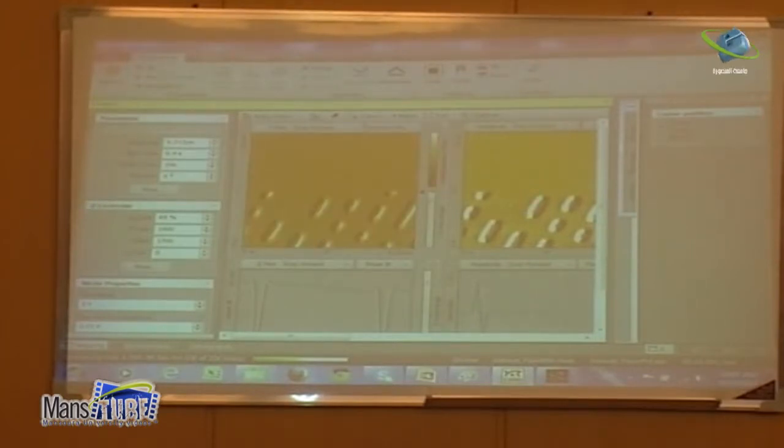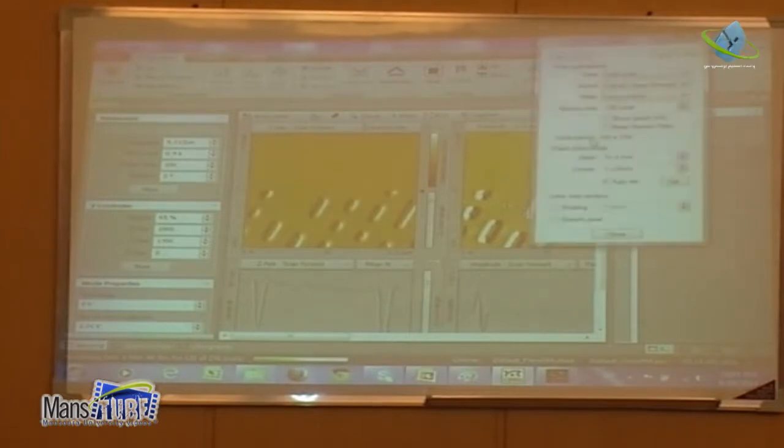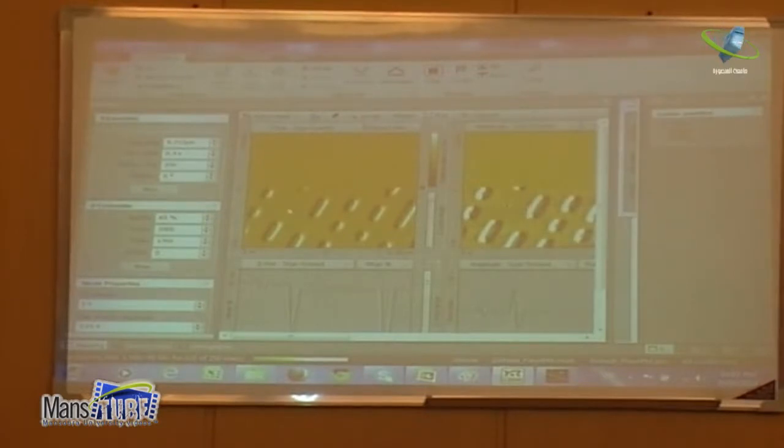You see it was here. So I mean, you see that the scratching in this direction and this direction works better than this direction. It doesn't work really perfectly.